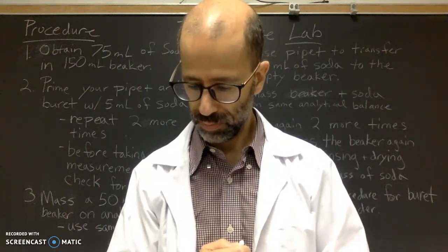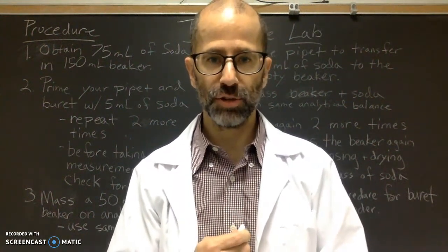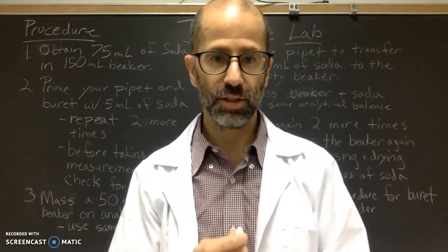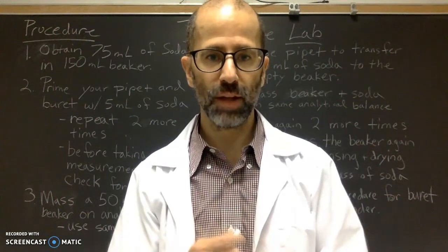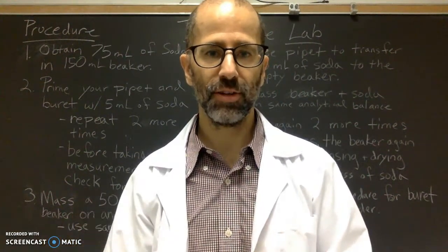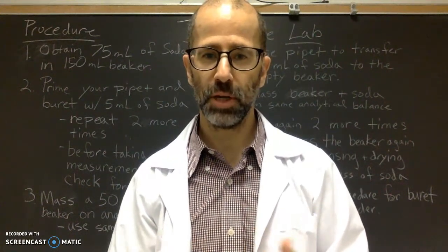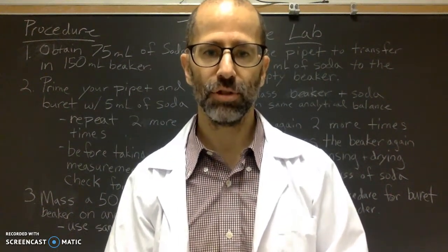Also, one of the reasons you want to make sure that you're following the procedure and doing everything as well as you can is because if your density is way off compared to where it should be, then I will be asking you to do it again.